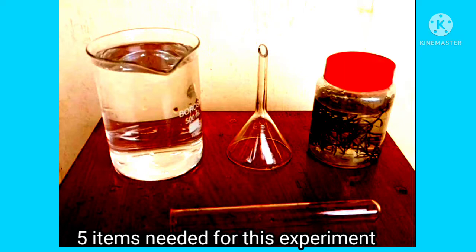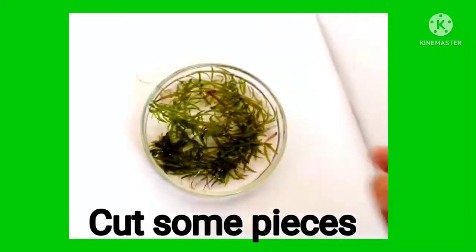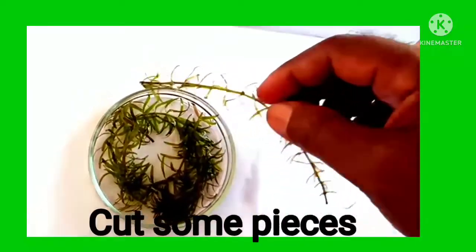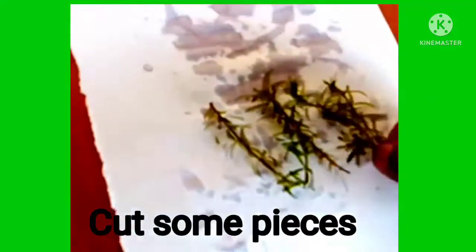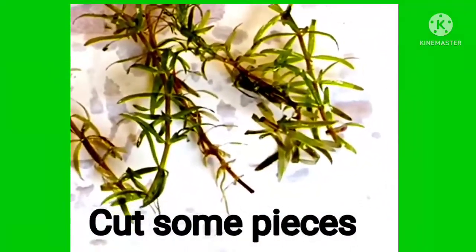The materials needed are: the Hydrilla plant, a small glass funnel, and a 10 or 20 ml capacity test tube. To set up the experiment, cut some pieces of the plant body — make 5 to 6 pieces of the filament and add about 4 pieces of the plant body.